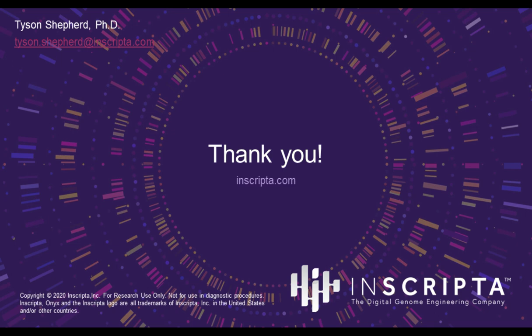Okay, thanks. That's another great question. This presentation was highlighting both of those applications. However, to clarify, the library that the data comes from here was generated originally from an ALE data set.